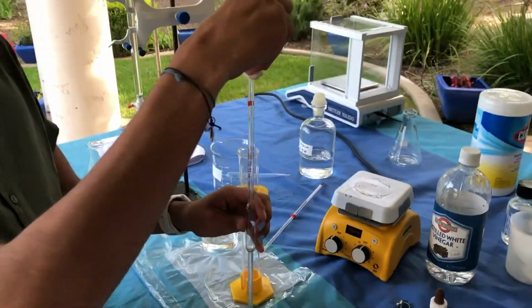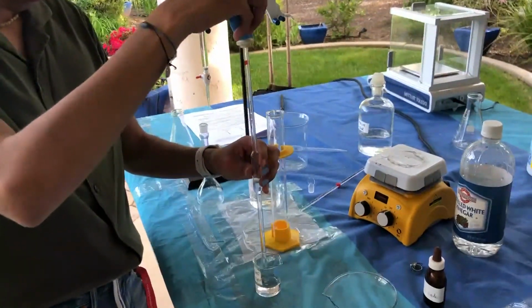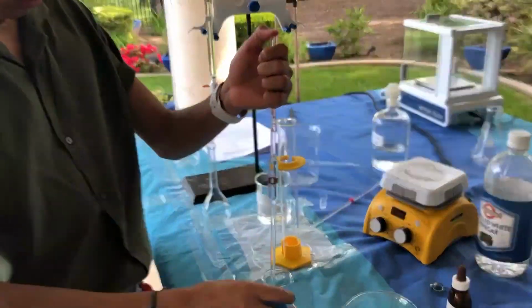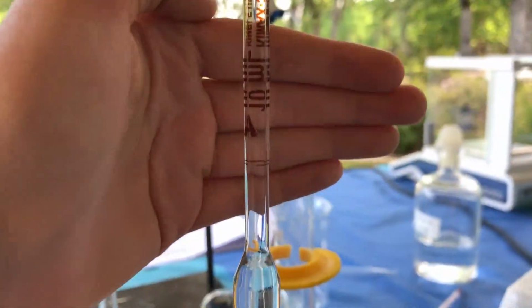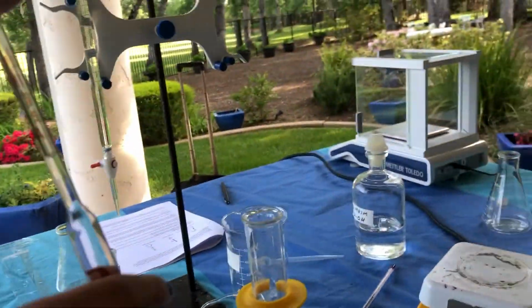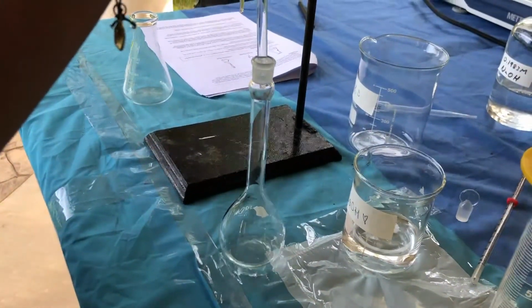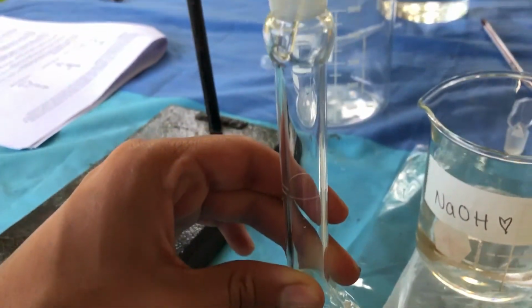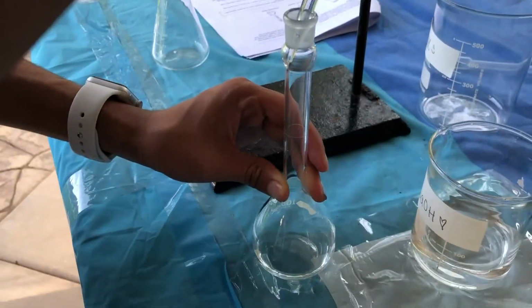We take our diluted vinegar and pipette 10 mLs into a 100 milliliter volumetric flask. And then take this and put it in the 100 mL volumetric flask. It's common practice to let it drain out on the side of the flask. Make sure all the drops get in.